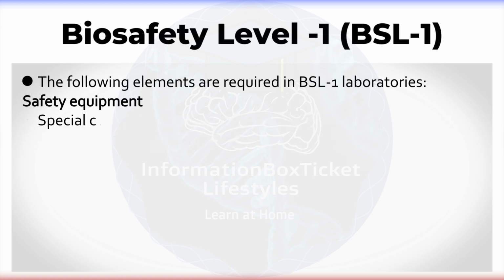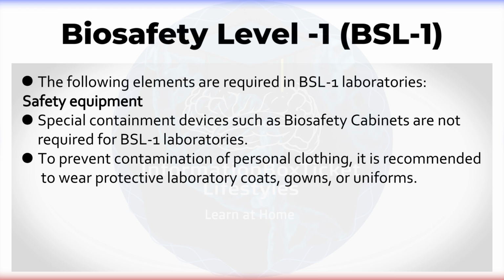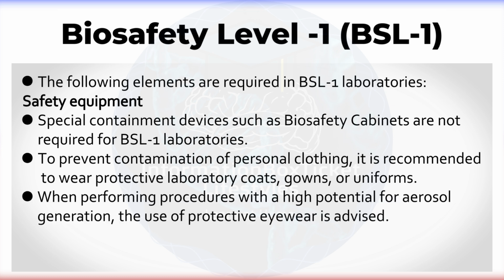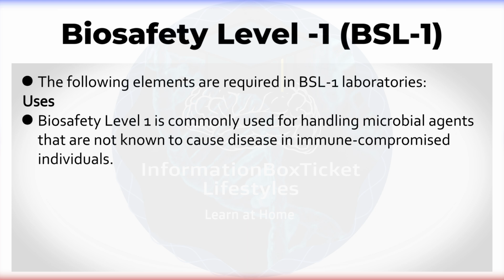Safety equipment. Special containment devices such as biosafety cabinets are not required for BSL-1 laboratories. To prevent contamination of personal clothing, it is recommended to wear protective laboratory coats, gowns, or uniforms. When performing procedures with a high potential for aerosol generation, the use of protective eyewear is advised. Uses. Biosafety Level 1 is commonly used for handling microbial agents that are not known to cause disease in immune-compromised individuals.